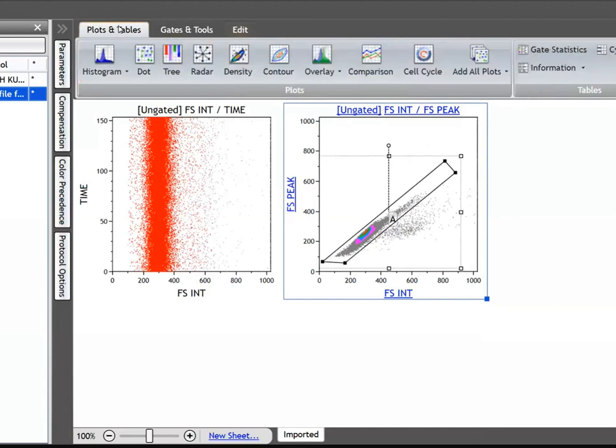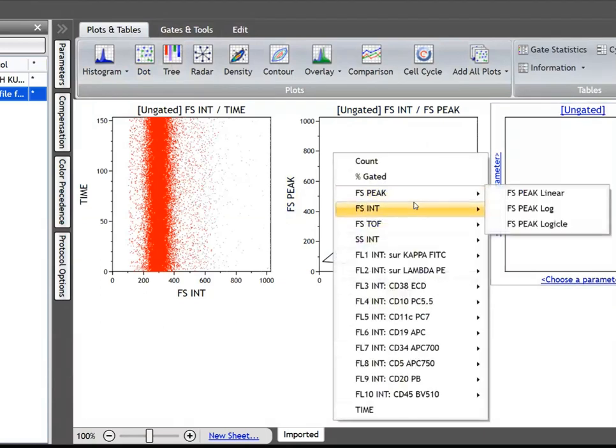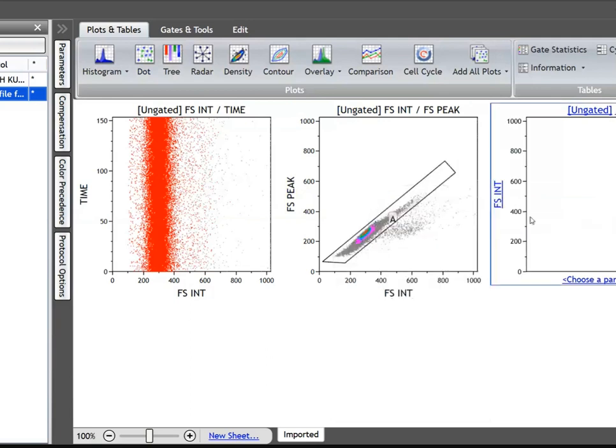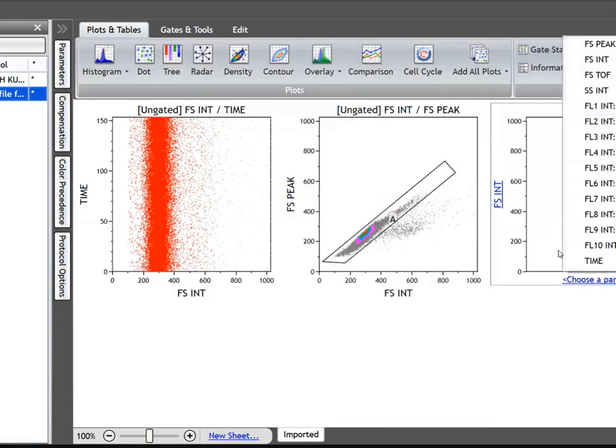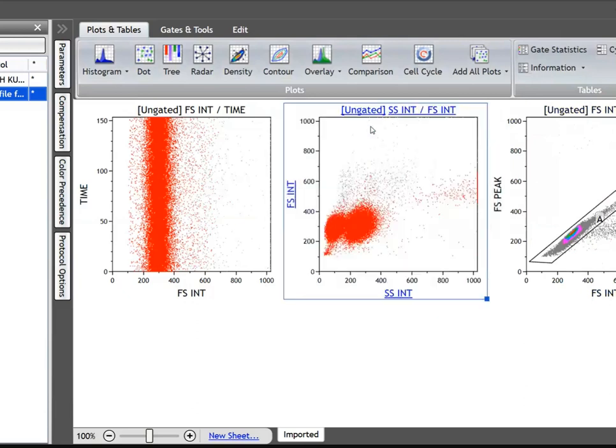Now the next plot, I'll just draw. Which plot can I show you? I'll show you again because the other plots may not be very useful. Sir, if the singlet shows rocketing, then it is not to be compensated? No. Singlets will always show rocketing. I thought you were going to ask me, sir, why did you go to singlet before the viability gate? I shouldn't do that, right?